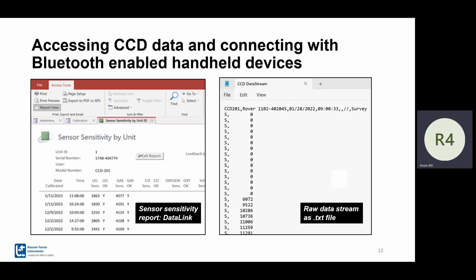Any sensor with a sensitivity above 500 is going to operate just fine. But as you start to see sensors, particularly maybe in year 2 or year 3, drifting down, you might want to preemptively change them, or not, but so long as it's within 3 years, we will warrant those sensors. So we have a 3-year warranty on the sensors. The rest of the machine is just plumbing.